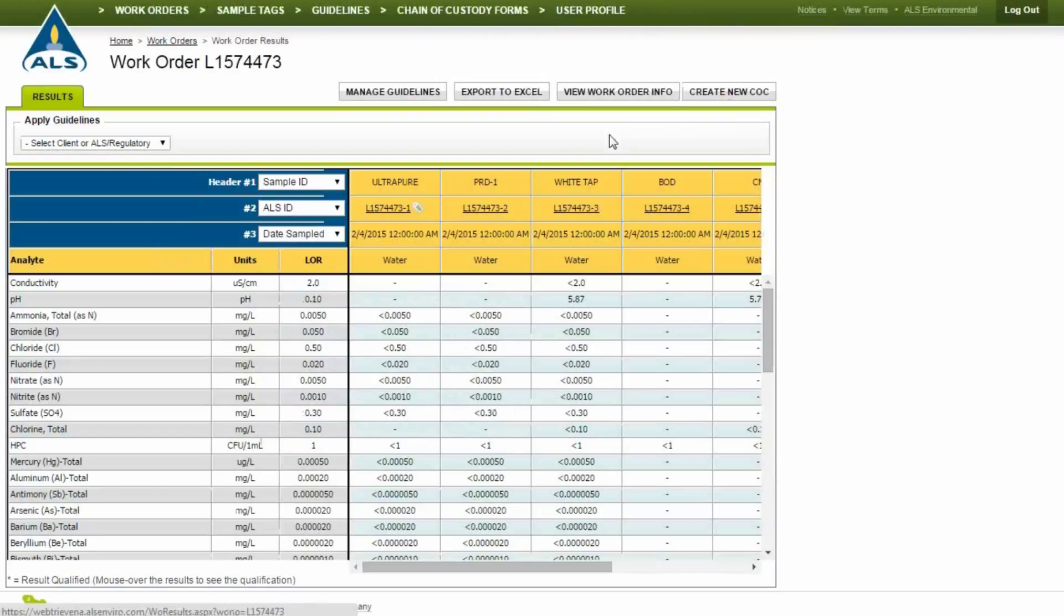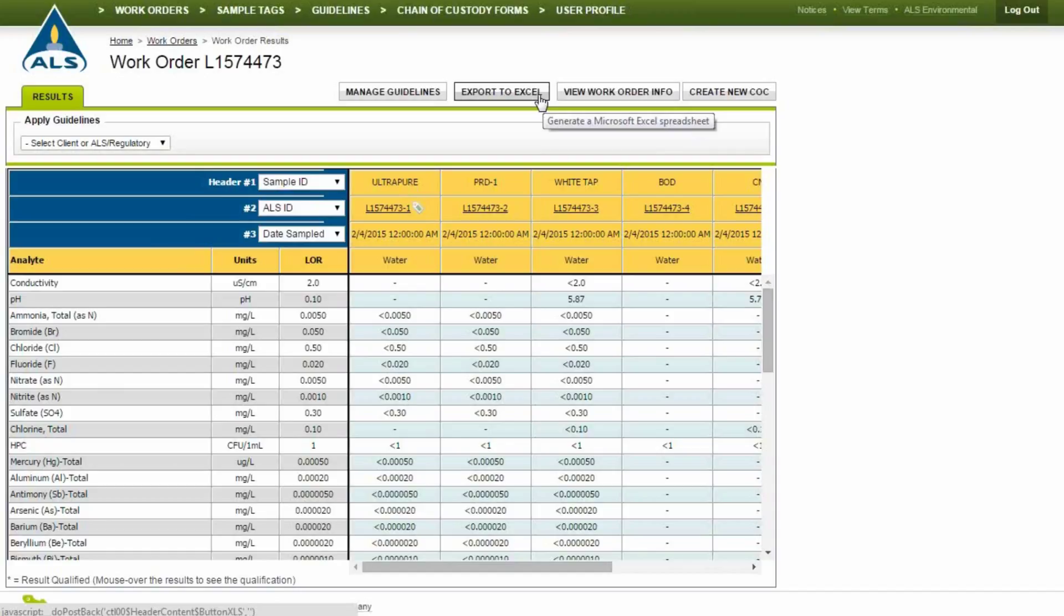Export the work order results to a spreadsheet by clicking Export to Excel. The export function will retain the original formatting, including the color-coded results.